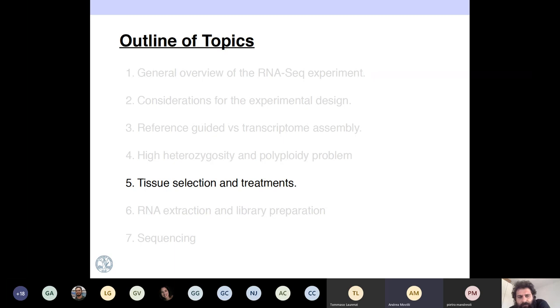Could we be using long reads as a reference, for example Oxford Nanopore or PacBio, right? A way to decrease the probability, so if I have two different alleles, maybe I have two long reads with different allelic forms. So it could be one by using the long reads as a reference.